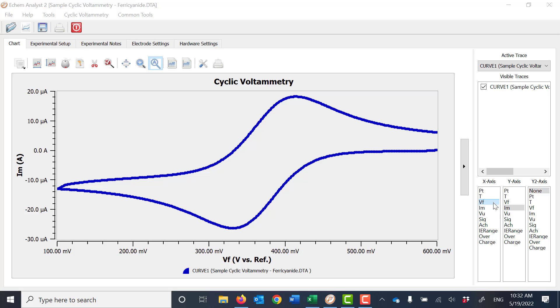Manipulate the data as you see fit, plotting whatever you want on the X-axis and the Y-axis. If you want a Y2, all you have to do is choose what data you would like to see. In this instance, we're going to go with current versus voltage.